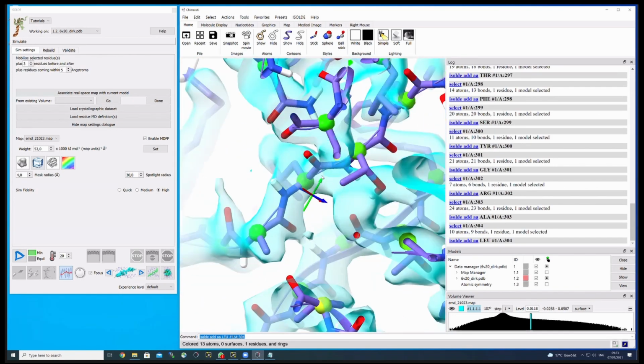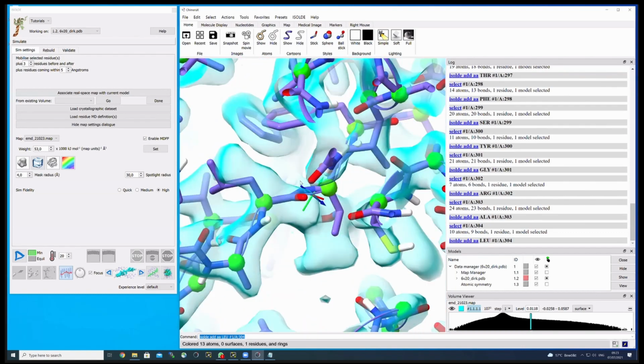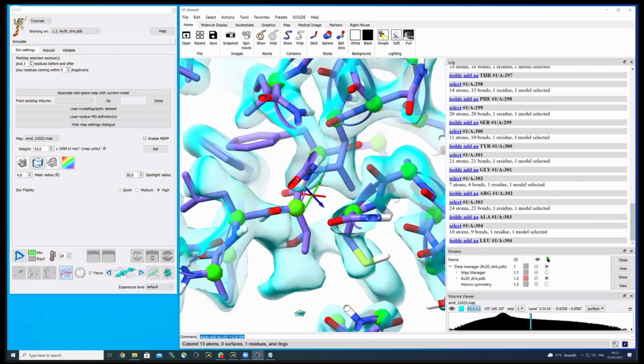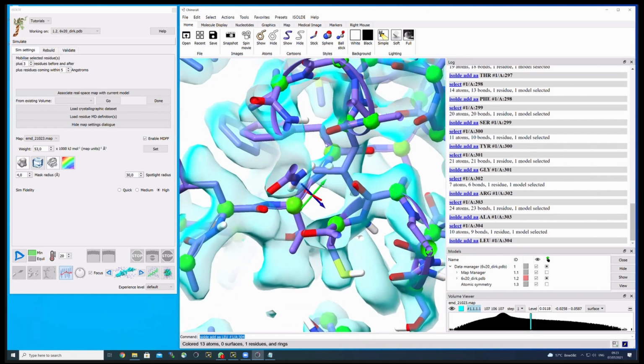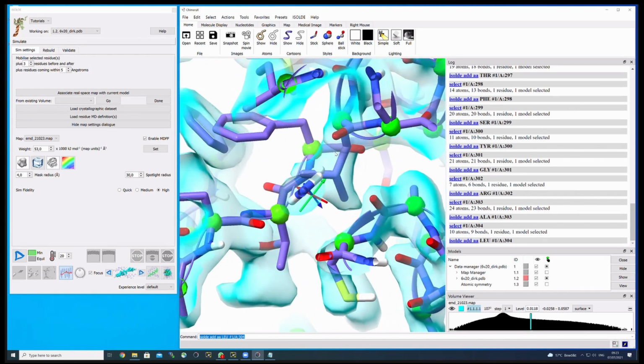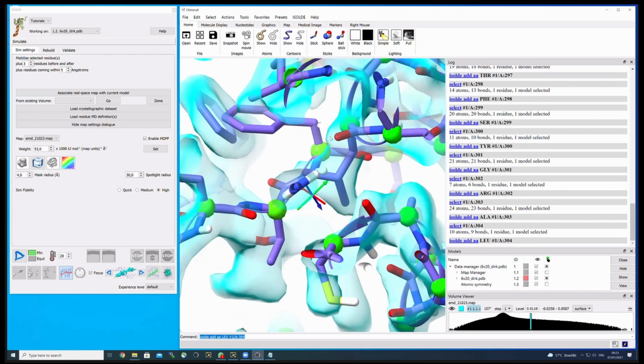you will see that all of a sudden all the residues appear magically. But what you will also notice, and this is now a little bit of a special situation that you will not face in programs like Coot, because ISOLDE is using a molecular dynamics simulation, and this is based on a minimizer function, so to speak.